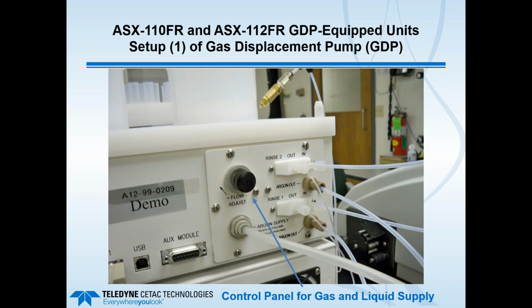Okay. So the peristaltic pump is fairly straightforward to set up. Of course, though, you have liquid flowing over peristaltic pump tubing, and depending upon the type of tubing you use, there is always the potential issue of trace elements leaching off that tubing. A cleaner alternative to peri-pump tubing is something called a gas displacement pump, or a GDP.